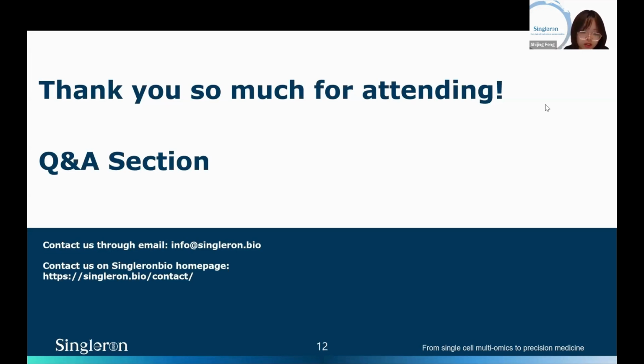And if you have more samples, that would be more complicated for this experimental design. But as long as you don't include the samples from the same donor into a single experiment, that would be fine.